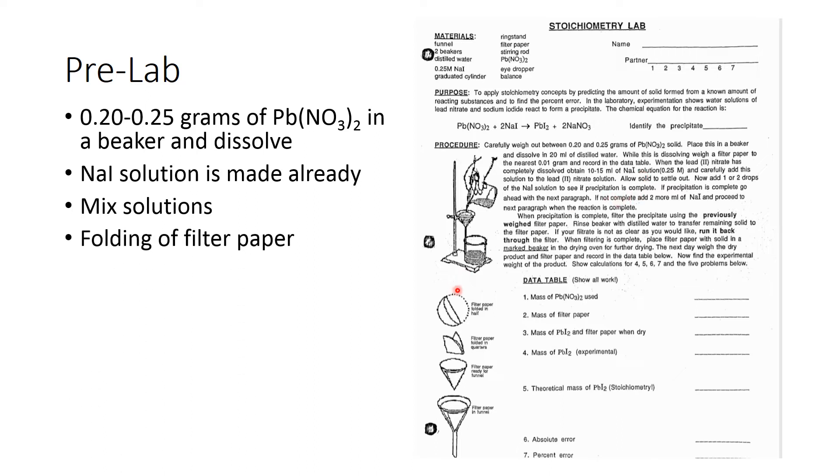You're going to filter it. There's a special way to fold the filter that's shown here. We also have a video I'd like you to look at that's linked on this Canvas page. You're going to take that beaker and get every drop into that filter paper that's in the funnel right there. You don't want your grade to be going down the drain later, so make sure you get as much as you can into that filter paper by using a stirring rod just like they're showing here.